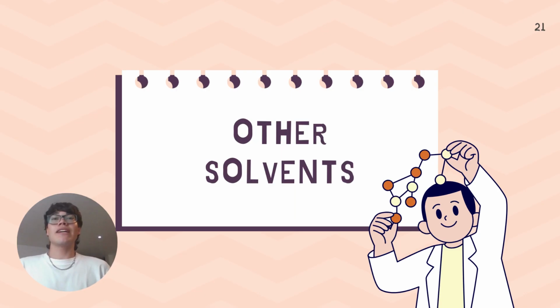Since we already analyzed the data from the crude oil sample and the one with 5% of acetone, that was the one given to our group, we can now discuss the results from the work of other groups with different configurations of solvents and see the viscobreaking properties of these solvents as a whole.